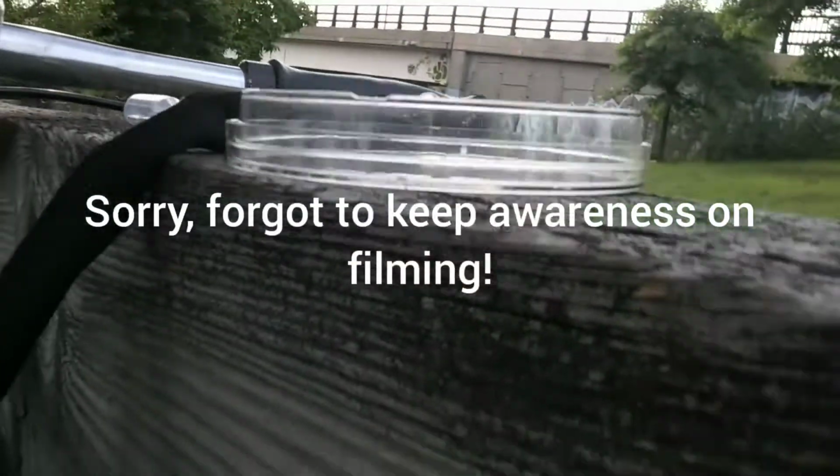Just do one drop to start, and then come like this, turn on the light. Usually you'd have a glass on both sides, so this might not really work at all. Also, I have to be careful because whenever I adjust the focus it moves down, but it looks like it's going to be okay. I'm gonna look first and then see if I can share anything. So this is not really working as expected. You just saw something go across the screen. I had zoomed in. Oh, there's something else. I zoomed into the water droplet.